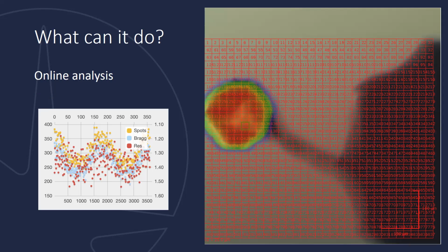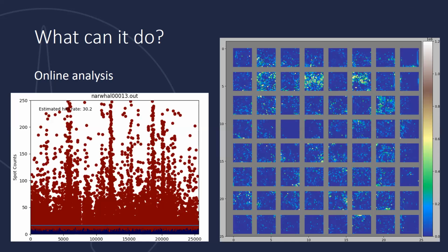We also use the same analysis as the basis for automated X-ray centering, which is a key component of the unattended data collection on the Diamond MX beamlines. We're also starting to make use of it to provide feedback for serial data collection. Again, that's initially with the spot finding on each image, but we're also looking at adding indexing into that as well in the near future.